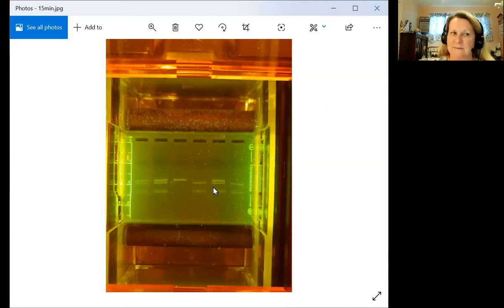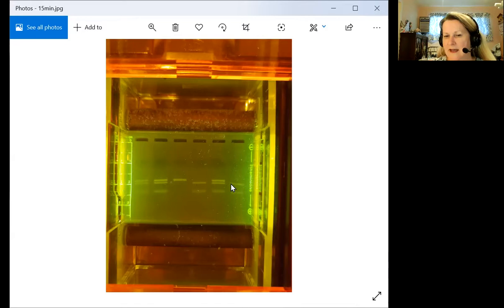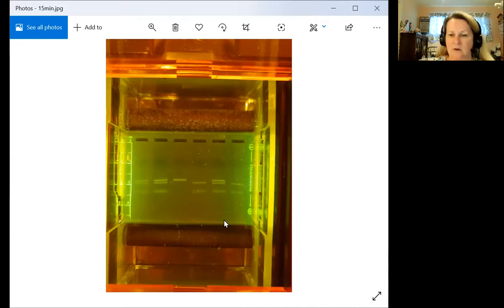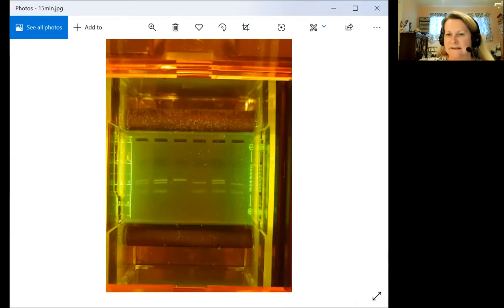This is the grandfather and the grandfather has one band and he is a taster. He is homozygous dominant. So really easy system to use that gives you super quick results.